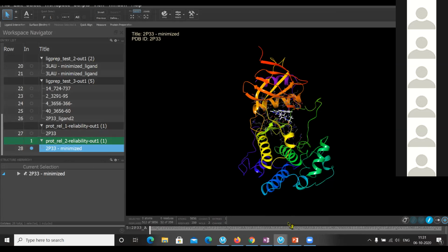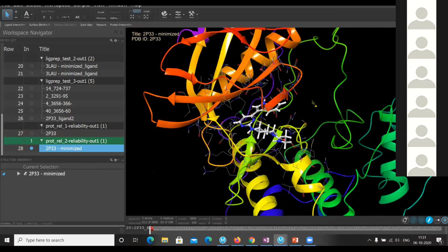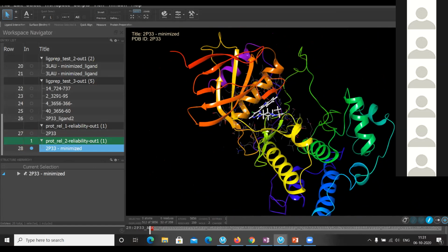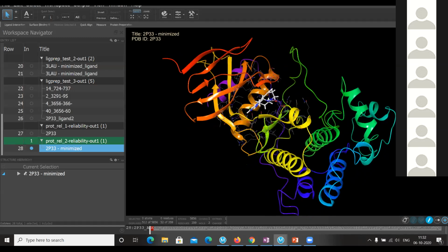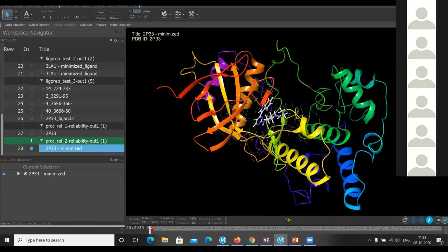Right. So the next question is, what is the purpose of removing selenomethionines, and why would there be selenomethionine in the protein? As I have mentioned, the selenomethionine is usually used by crystallographers to help them crystallize a structure. I do not know the chemical basis as to why it is used and how it helps in crystallography, but it is sometimes used just to help them crystallize a structure. And so you should convert them from selenomethionines to methionines before you proceed with any of the calculations.